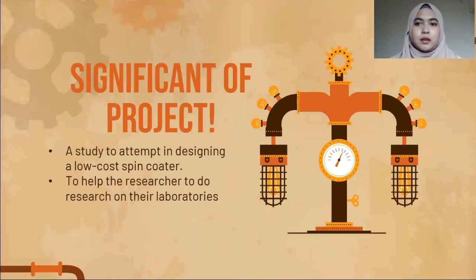Significance of the project. It is a study to attempt to design a low-cost spin coater and to help researchers do research in their laboratories. It is due to the expensive market price of spin coater machines, and using recycled hard drives will reduce the use of natural resources.